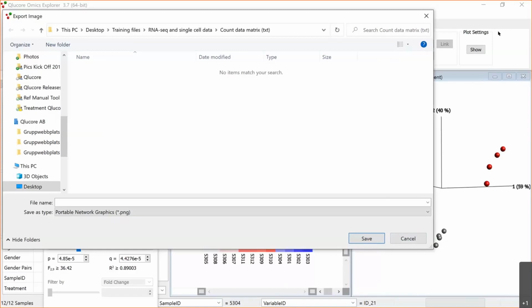One more question. In the analysis of BAM files, can you limit the analysis to a particular gene type, miRNA, or coding? No. Coding gene? No, I think we will pick everything that's in there. Yeah, we will grab everything in there. So I don't think that you can put that filter on it during the normalization.